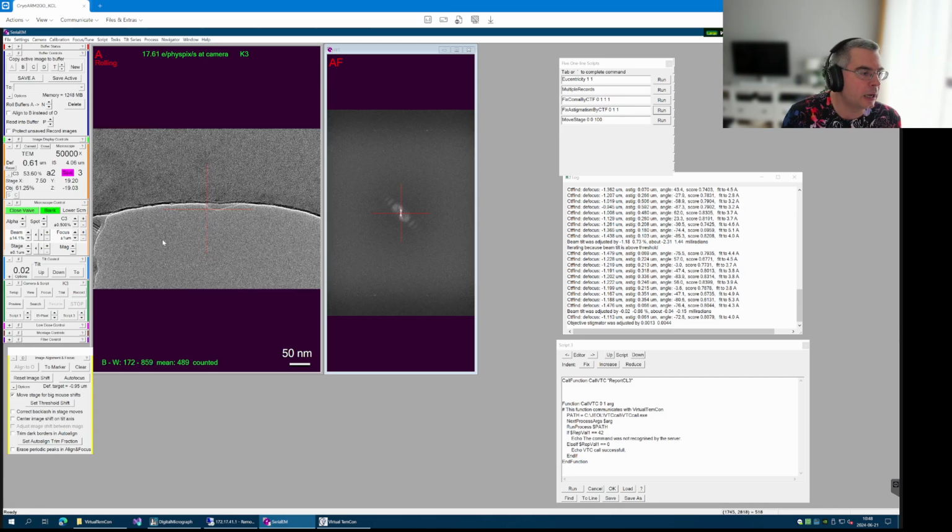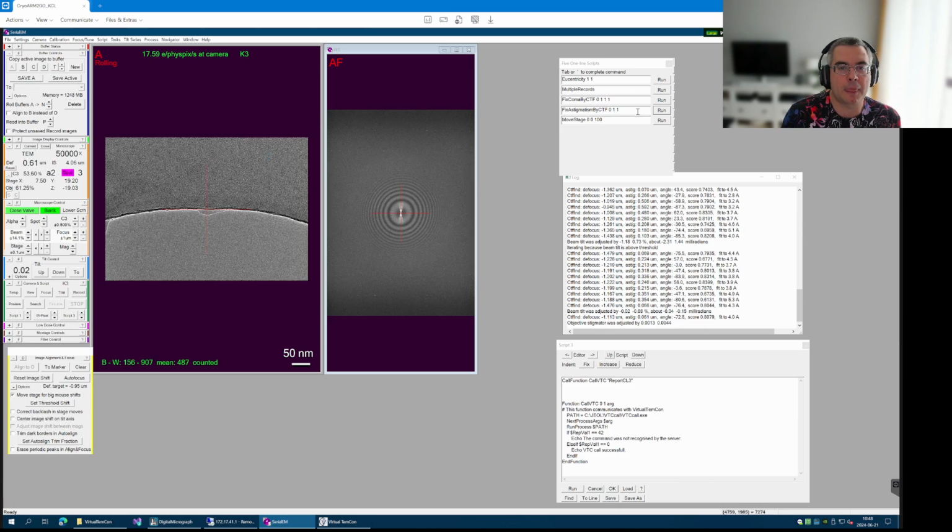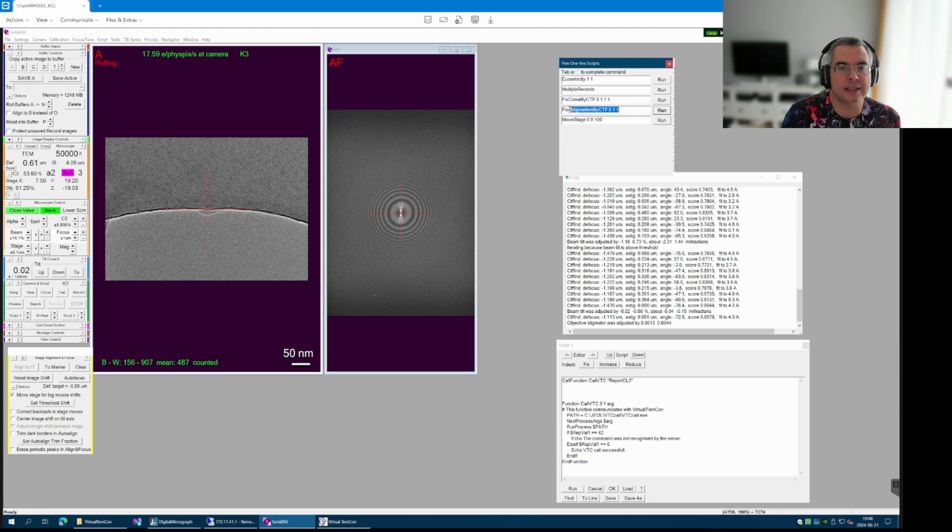Here we go. So we may want to position it a little bit better, like that. And again, let's take a record picture. That's fine. And then let's try to fix astigmatism and fix coma. We start with coma.